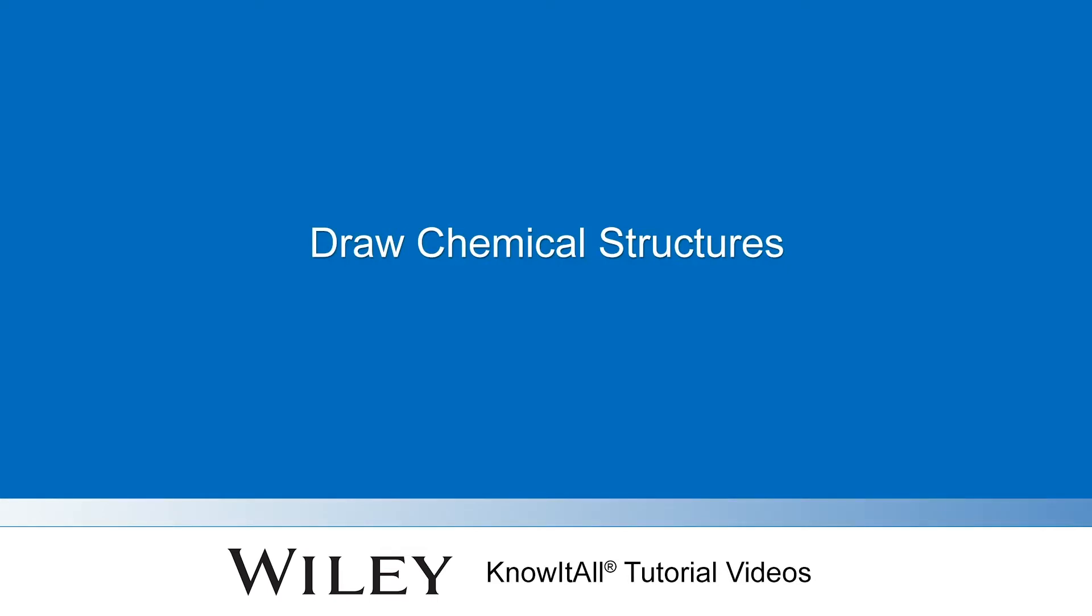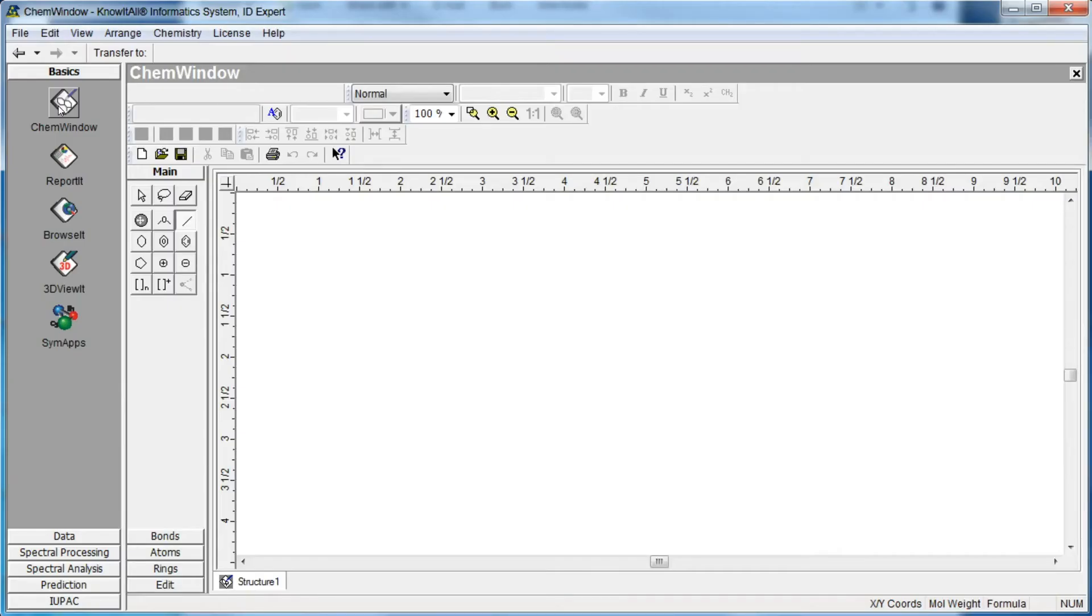Welcome to a demonstration of how to draw a chemical structure using the Know-It-All informatics system. The application opens to a blank drawing.